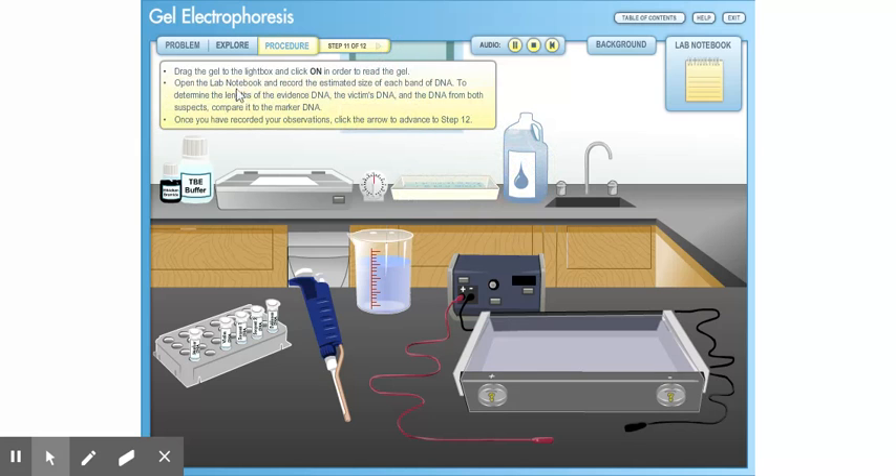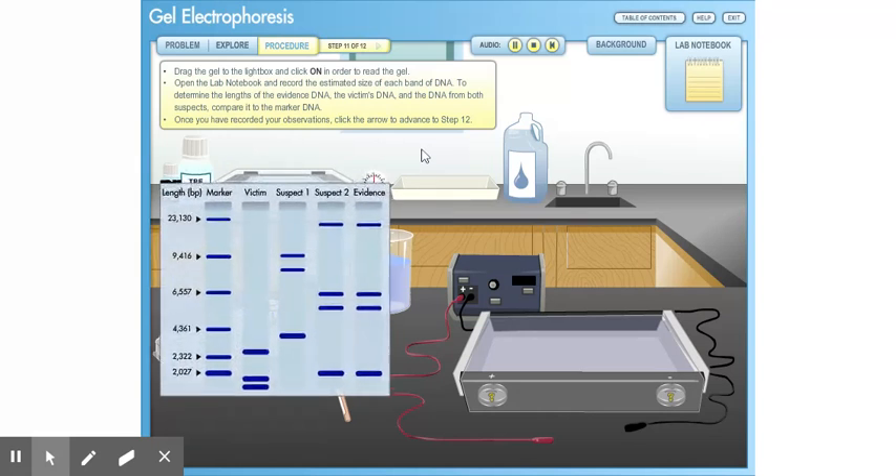Drag the gel to the light box and click on in order to read the gel. Open the lab notebook and record the estimated size of each band of DNA. To determine the length of the evidence DNA, the victim's DNA, and the DNA from both suspects, compare it to the marker DNA. Once you have recorded your observations, click the arrow to advance to Step 12.